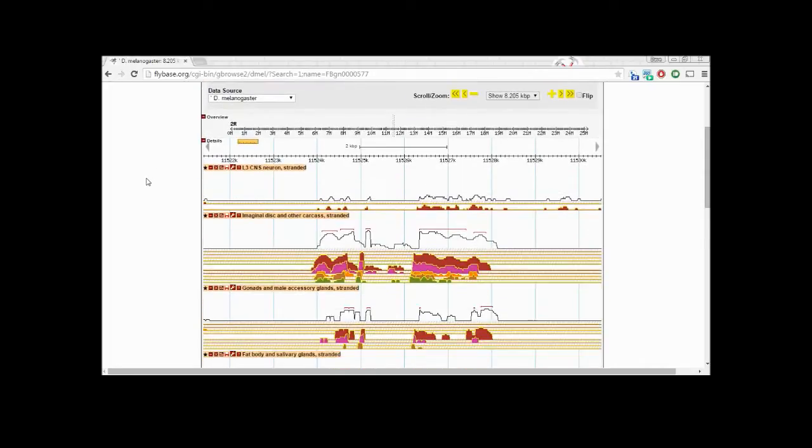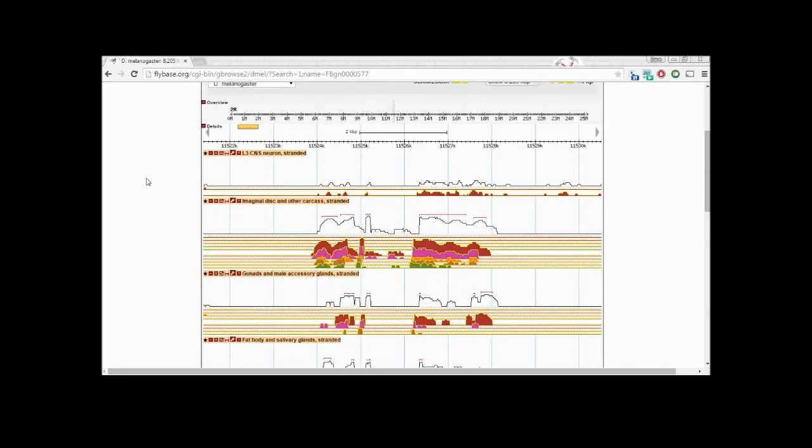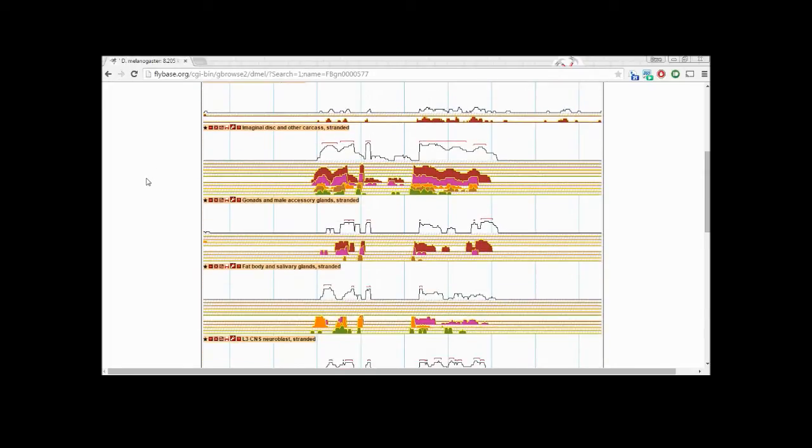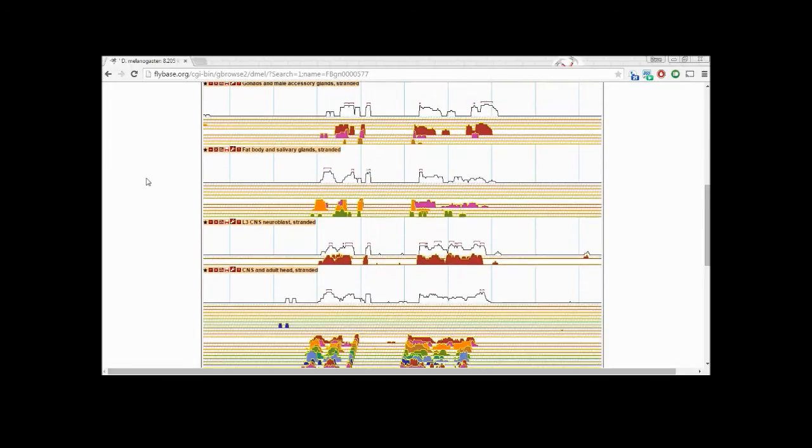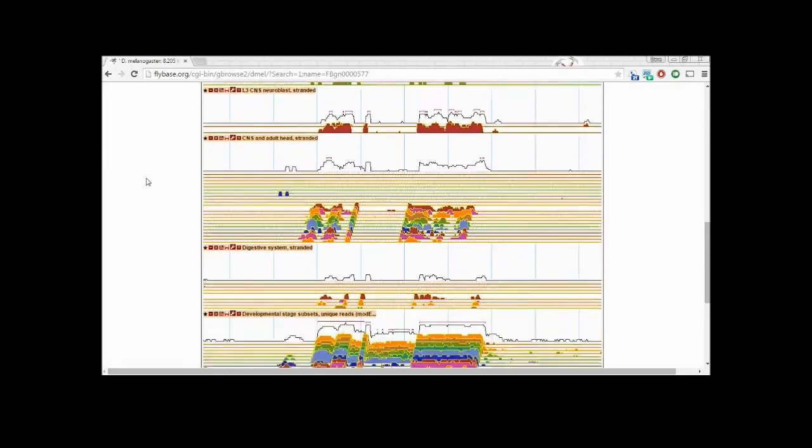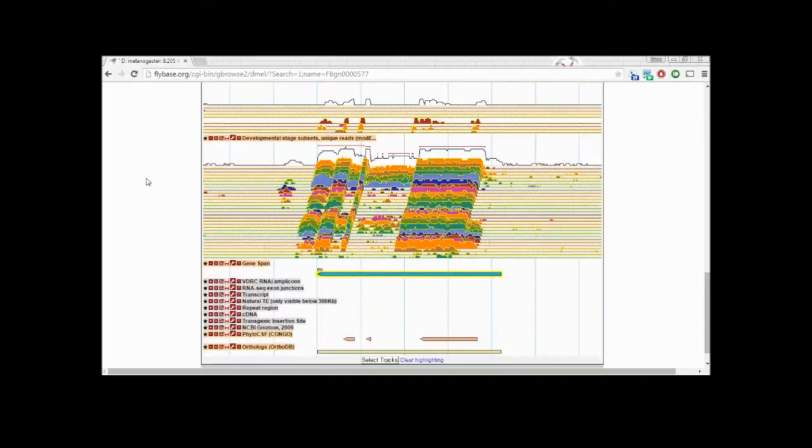We select the browser option again and see our data visualized. Our first few rows of data each show the RNA transcription happening in a specific tissue type. If we scroll to the bottom, we can see similar diagrams showing when the gene is transcribed anywhere in the body throughout development.